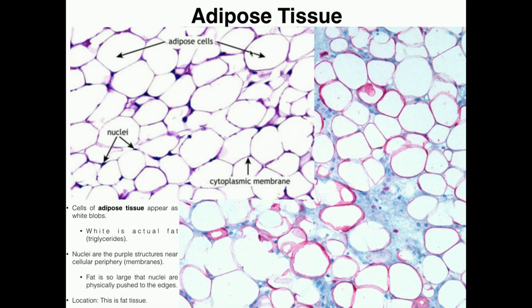If you look at these cells, each one of these white blobs is a cell. Since they're fat cells, they hold a tremendous amount of fat — triglycerides, cholesterol, all sorts of lipids. This entirety of the white area is all lipid. See this purple dot on the exterior by the membrane — that really dark spot is the nucleus. With adipose tissue, there's so much fat stored inside the cell that literally all the organelles, including the nucleus, are all pushed to the periphery of the cell. The nucleus is pushed to the cell membrane because the lipid droplet inside is so massive. Individually, each cell is called an adipocyte, but the whole tissue is adipose tissue.